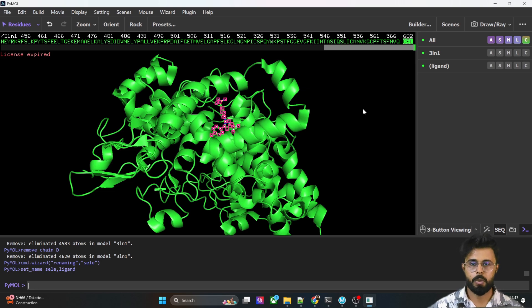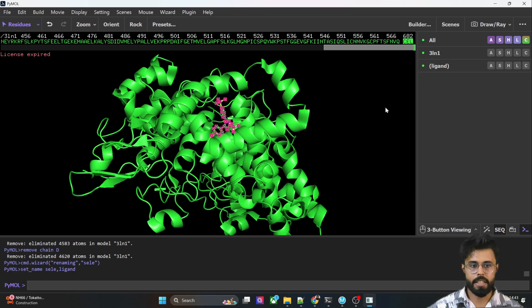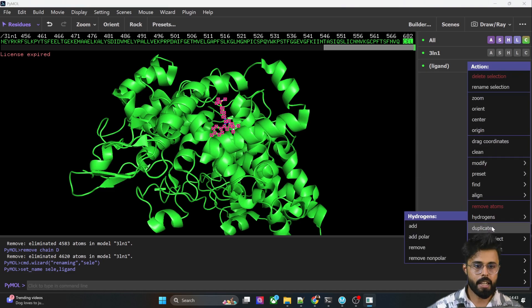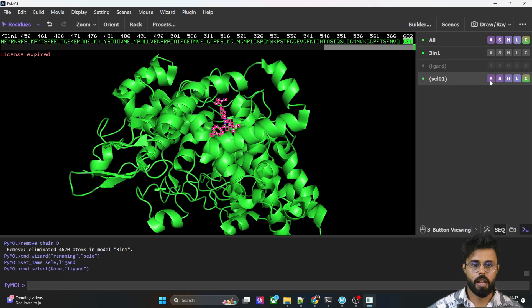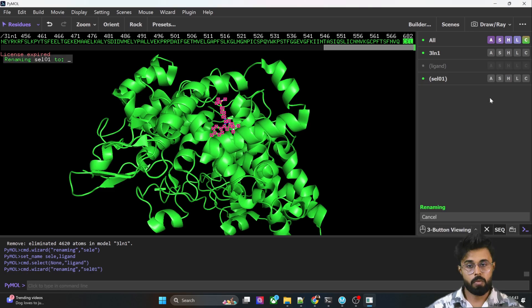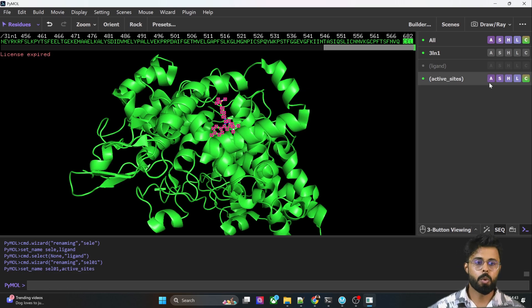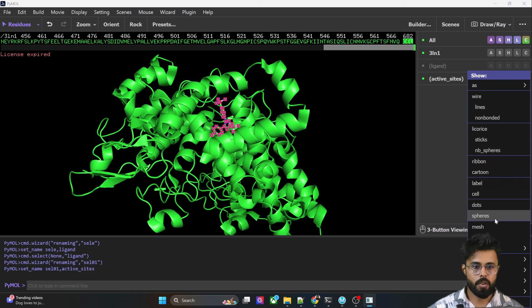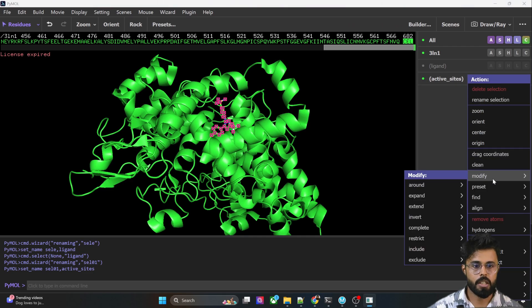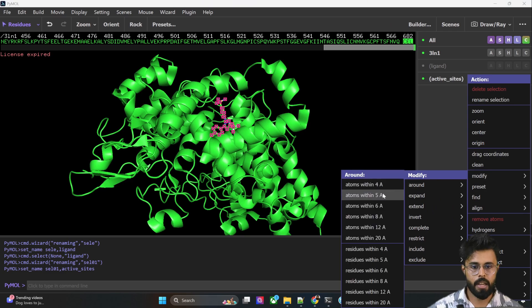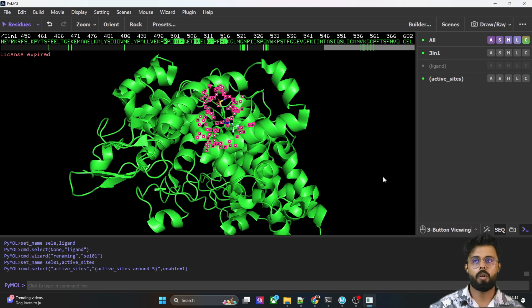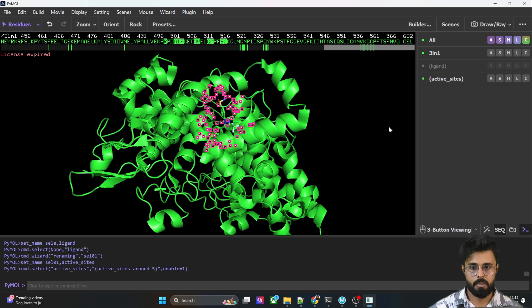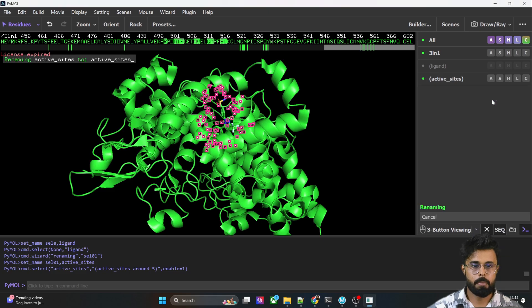We are going to find the amino acids around 5 Ångströms from the ligand. We can duplicate this tab and change the name to 'active sites'. In the action option, go to Modify, then Around, and select 'atoms within 5 Ångströms'. You can see it has already selected the amino acid residues around the ligand within 5 Ångströms.